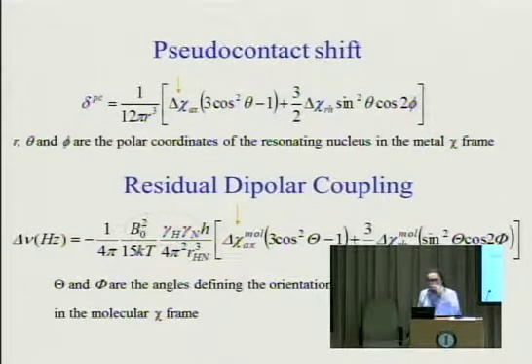But if you use a diamagnetic system as the reference, so you subtract that, you also subtract the effect of the protein, and so these two numbers should be exactly the same. So you get the same delta chi values, axial or rhombic, for pseudocontact shifts or for residual dipolar coupling. So we are measuring the same thing with two completely independent kinds of measurements, because this just comes from your assignments and this comes from the measurement of, for example, 1J couplings.